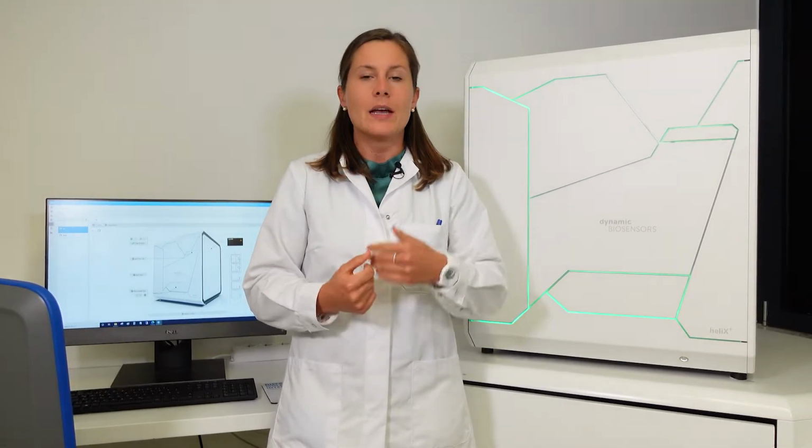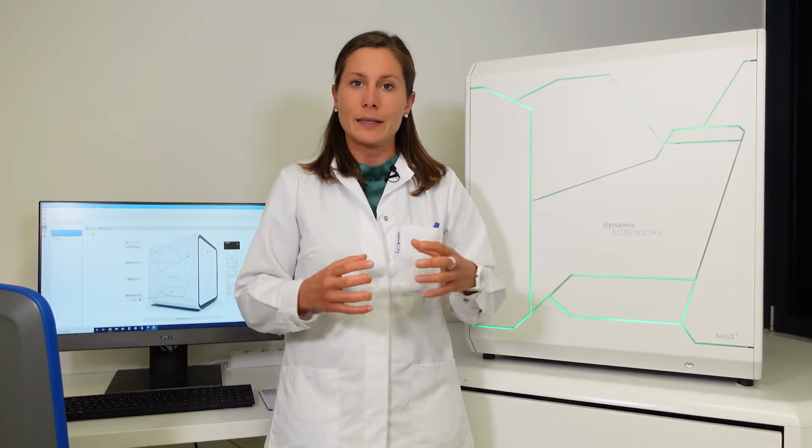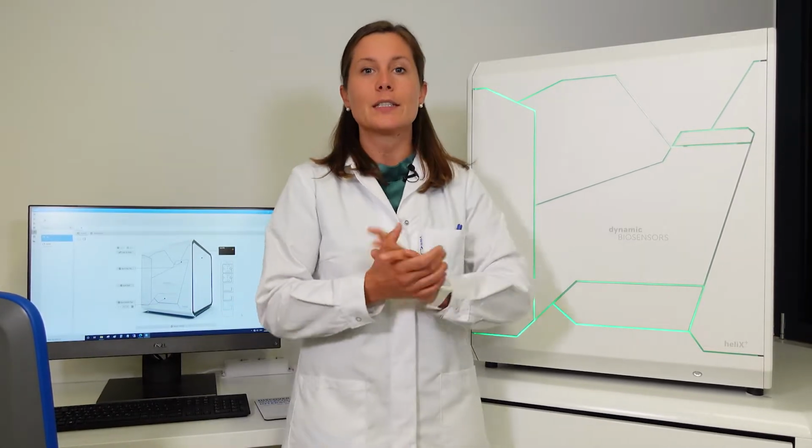I'm Alice and today I would like to show you how to measure tight binder kinetics. In detail, we are going to measure the binding affinity between streptavidin and biotin. And to do that, we are going to use our heliX device. Here it is with me, and I think we are ready to start.